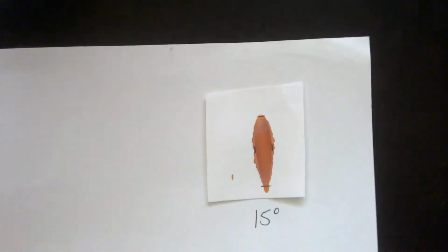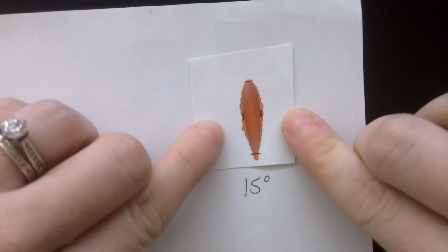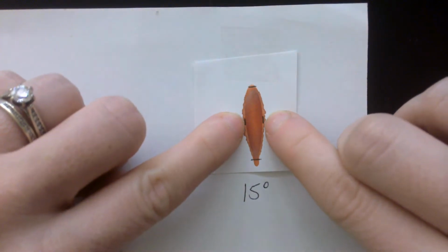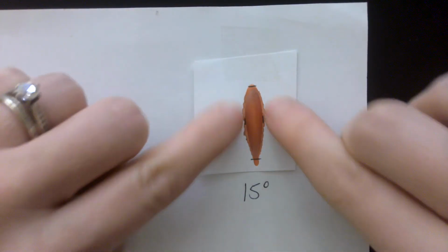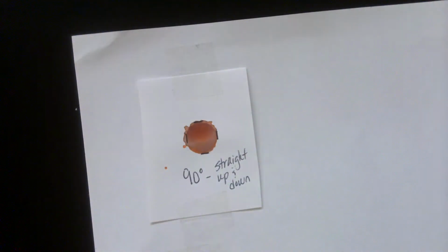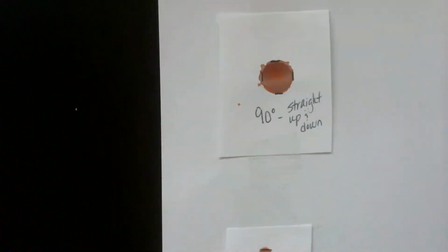I just used regular computer paper and it caused the blood to kind of expand off of the original drop. So you don't want to measure those spikes, is what they're called, or projections. You just want to measure the blood drop. So let's start with 90 degrees. We're measuring in millimeters.